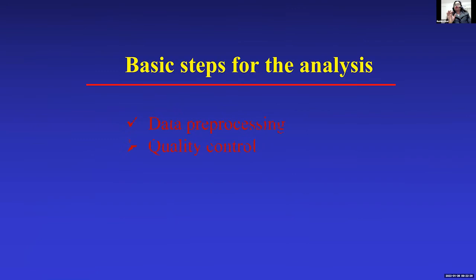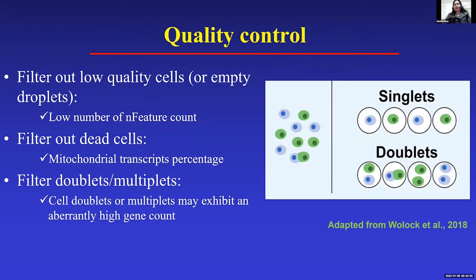And so we have done the data pre-processing for now. The pre-processing was, we got the link to download. We can either click on the link and download it on our system, or do wget and get it downloaded on your CyVerse or wherever you want to keep it. And then we start with the cellranger count, get it done, and then save the matrix files. And once we are done with that, we do the quality check. How do we do the quality check?